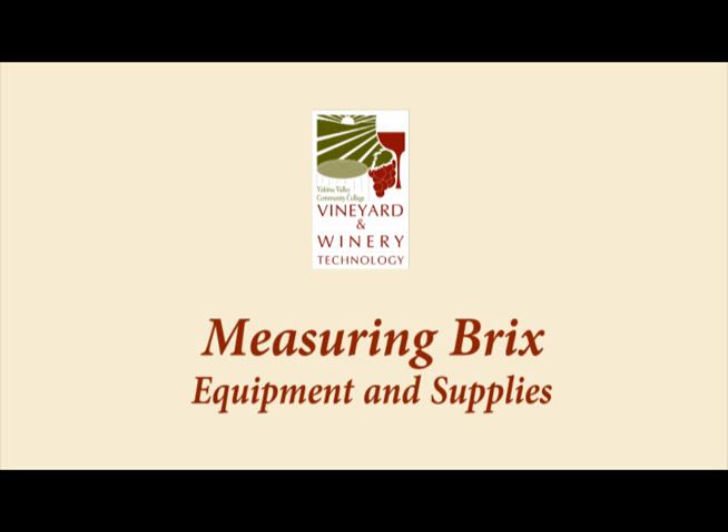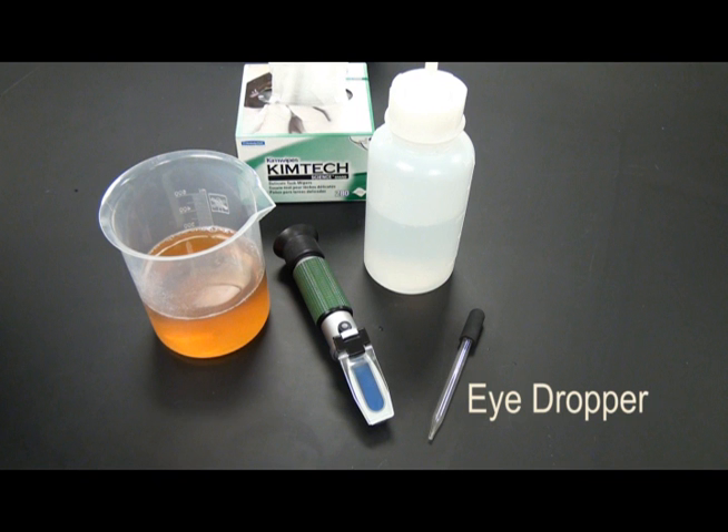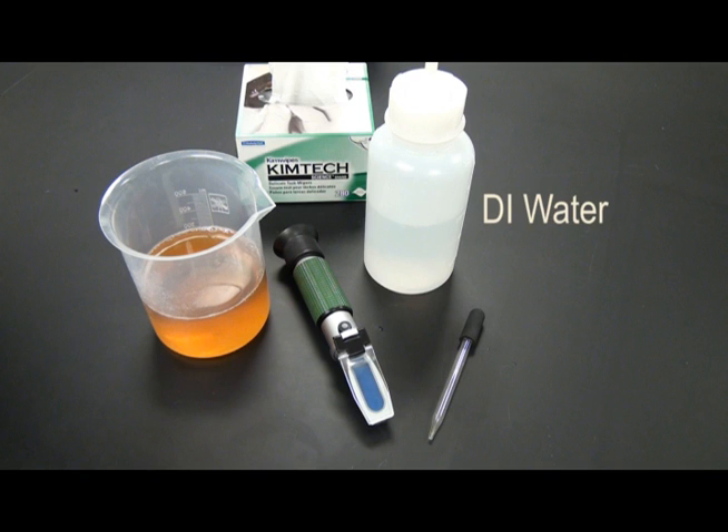The equipment needed to test brix in juice with a refractometer includes a refractometer, eyedropper, juice sample, a DI water bottle, and kimwipes.